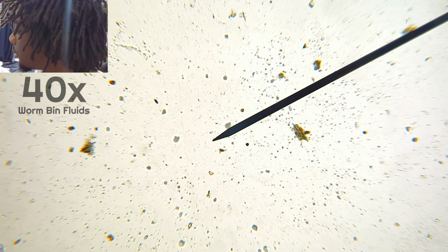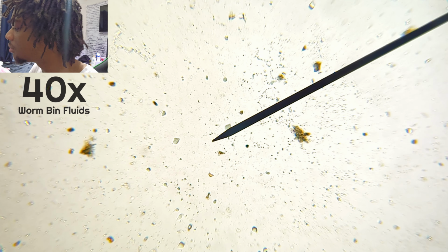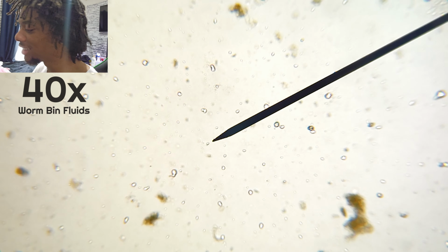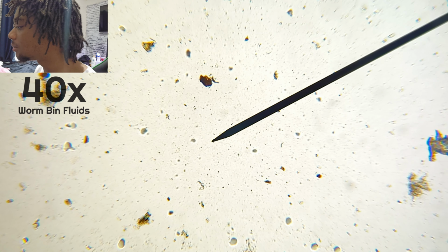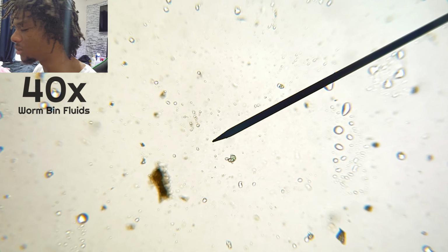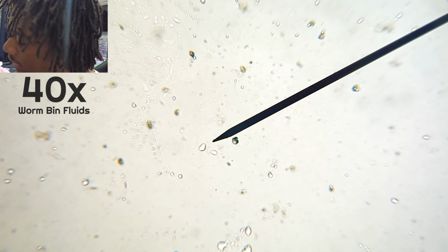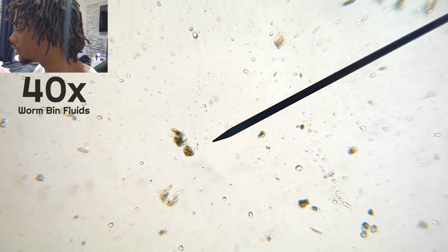Okay, let's get it in there, and then let's raise it. Let's see what we have in there. Not seeing much movement at all. I said my microscope is very simple, not a very fancy one. So I'm moving it with my hand. I know college ones, they have like a separate thing for that. I'm not gonna lie, so far I'm not seeing anything. Some debris or organic matter or something like that. But I'm not seeing like the ciliates and stuff that I saw before. I wonder if that's gonna be an issue.